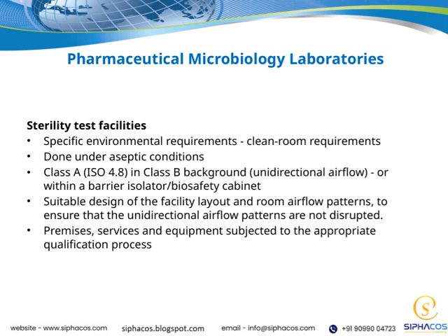The design of the facility layout and room airflow patterns plays a vital role. It's important that these airflow patterns are carefully planned and maintained so that they are not disrupted, which could compromise the sterile environment. Proper airflow helps ensure that any contaminants are swept away and do not reach the critical testing areas.